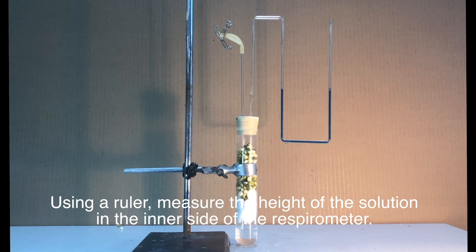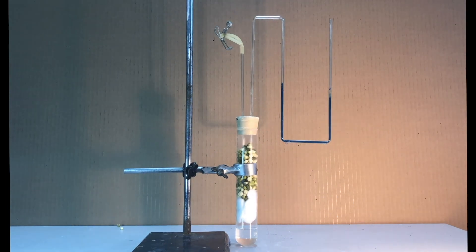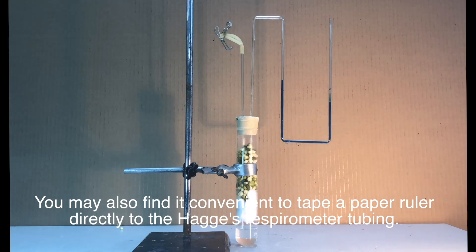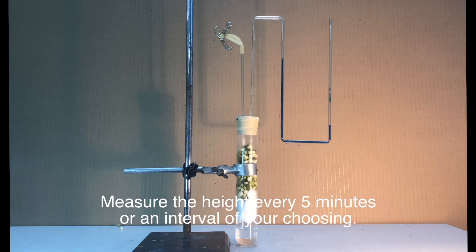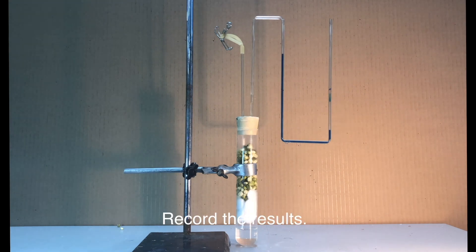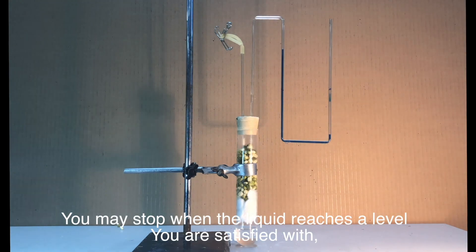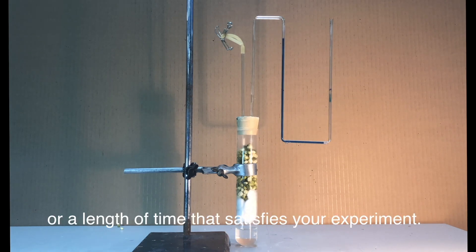Using a ruler, measure the height of the solution in the inner side of the respirometer. You may also find it convenient to tape a paper ruler directly to the Hagge's respirometer tubing. Measure the height every five minutes or an interval of your choosing. Record the results. You may stop when the liquid reaches a level you are satisfied with or a length of time that satisfies your experiment. Repeat this process at least five times.